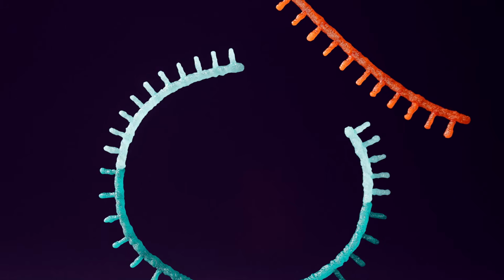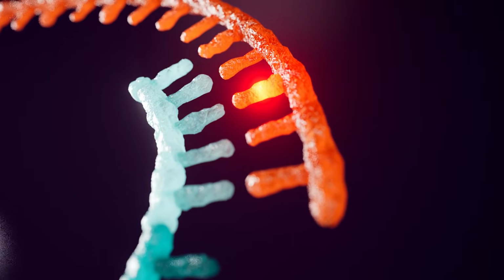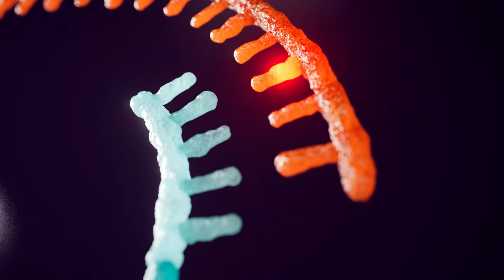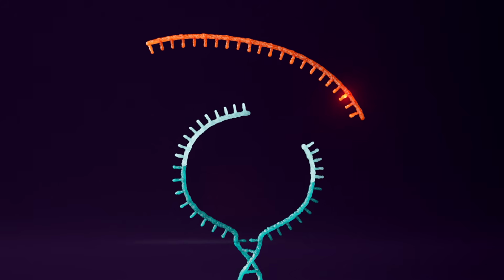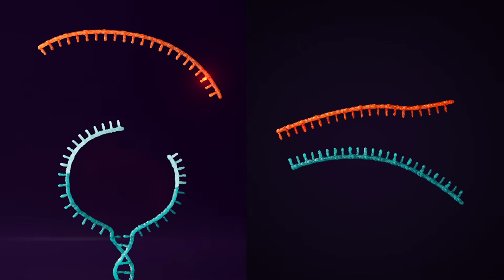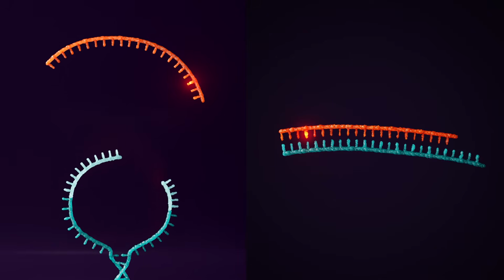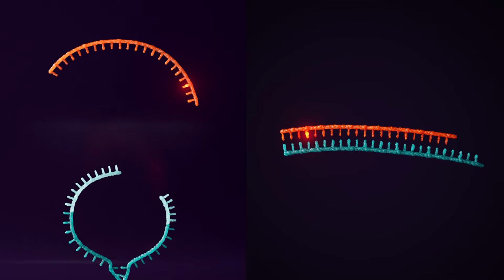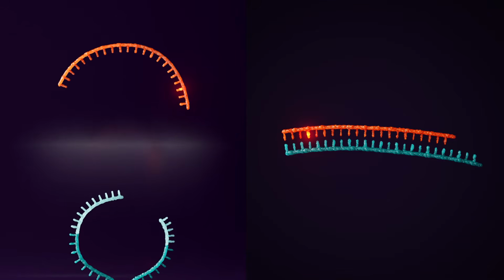In the case of a mismatch in either of the hemiprobes, interaction is weakened. Compared to a standard primer RNA interaction, the two-site interaction dramatically increases specificity in the RT step. While a mismatch perturbs only 1 out of 20 bases with standard PCR, the two hemiprobes lead to a mismatch of approximately 1 out of 5 bases.